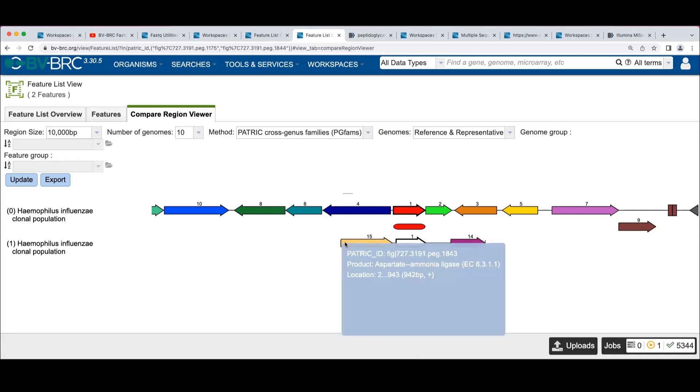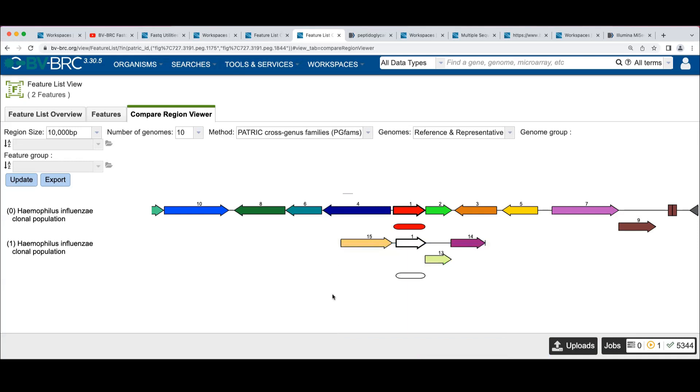And there's one you can't see over here that marks the other end of this contig. Or you can tell, this goes from location two to 943. So we know this is butted up against the end of the contig.